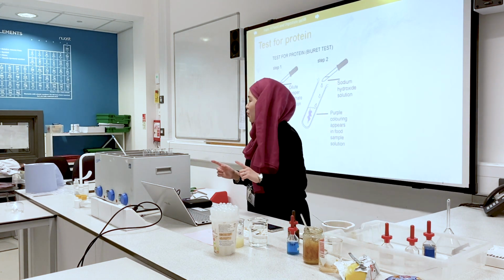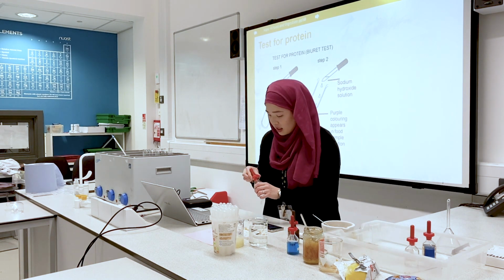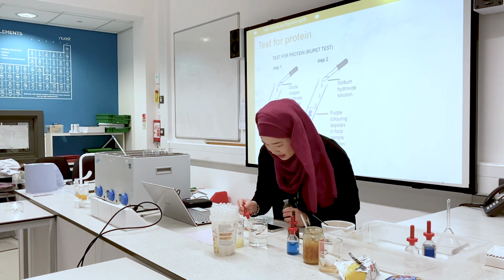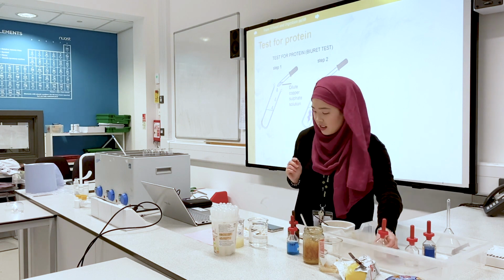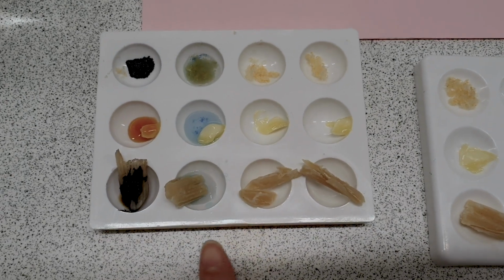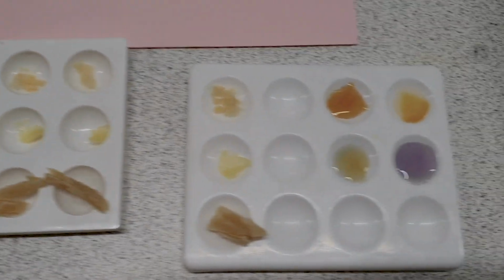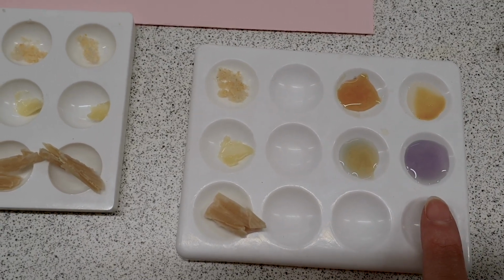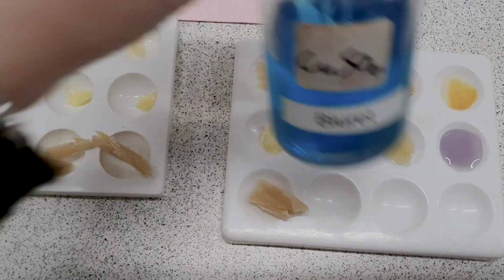We know egg has protein in it. Do I have a spare test tube? Let's add sodium hydroxide. Yes, now it'll work. It's fine. So you can see that with the protein, it is not present in Wotsits, butter or pasta. It is present in egg, but not honey. Your Biuret solution has changed from blue to purple.